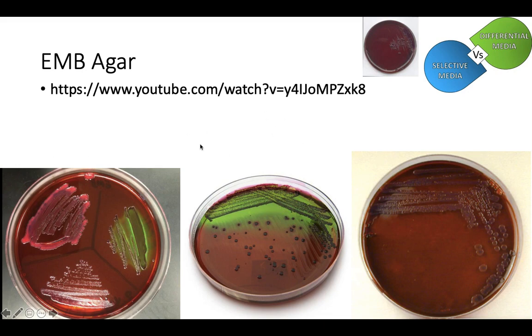Now, what happens if you can't eat lactose? Well, if you're somebody like Salmonella who can't eat lactose, you're going to eat the proteins in this agar, the default answer. You're going to eat the proteins. Those proteins are going to be hydrolyzed into a basic byproduct. That basic byproduct will be released out of your cells into the agar. And bases do the exact opposite of acids when it comes to the cell wall. They make the cell walls condense. They make the cell walls harder. So basic pHs make cell walls dense.